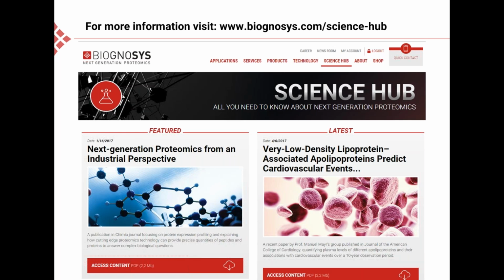Adding on that, what I did not show in this tutorial is the option to actually select or to input given peptides into the panel generation module. The easiest way for this would be to copy-paste the peptide sequence from the SpectroNaut results report into the panel generation module when loading the same spectral library that you have used for the DIA analysis. If you're interested in getting a more in-depth tutorial about SpectroDive, feel free to contact us at support@biognosys.com, and we can schedule a one-on-one meeting and discuss more about the software.